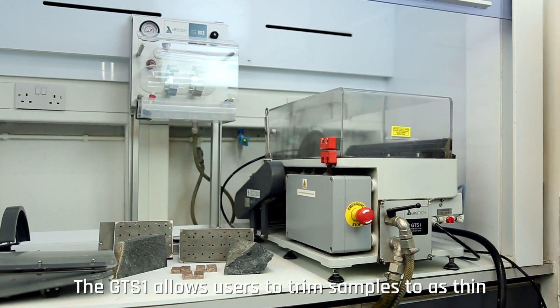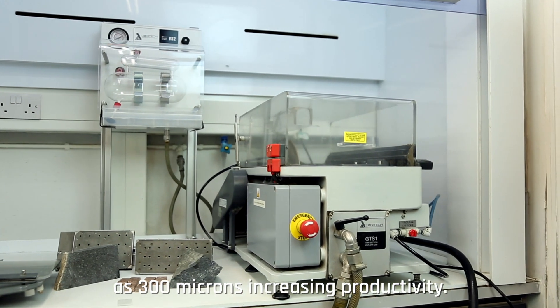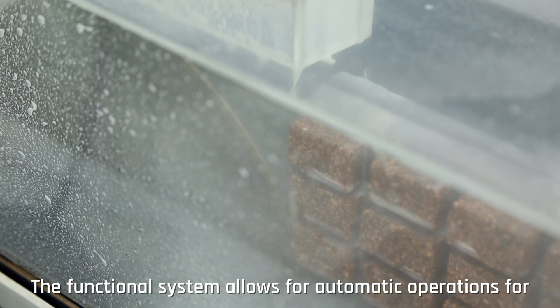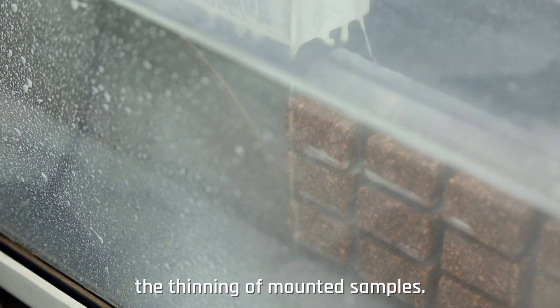The GTS-1 allows users to trim samples to as thin as 300 microns, increasing productivity. The functional system allows for automatic operations for the thinning of mounted samples.